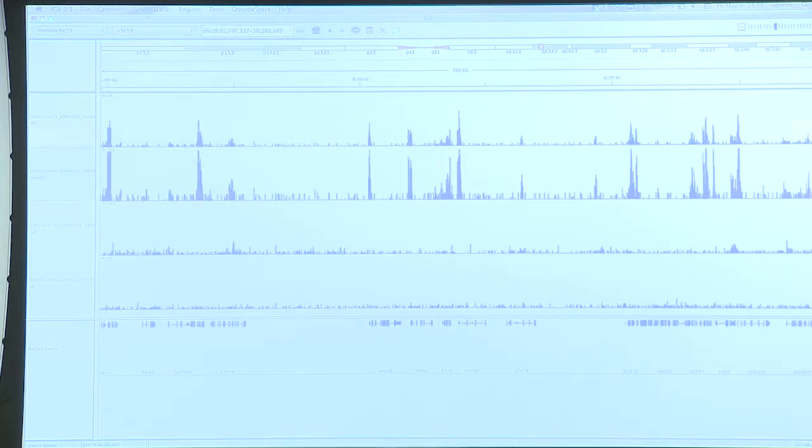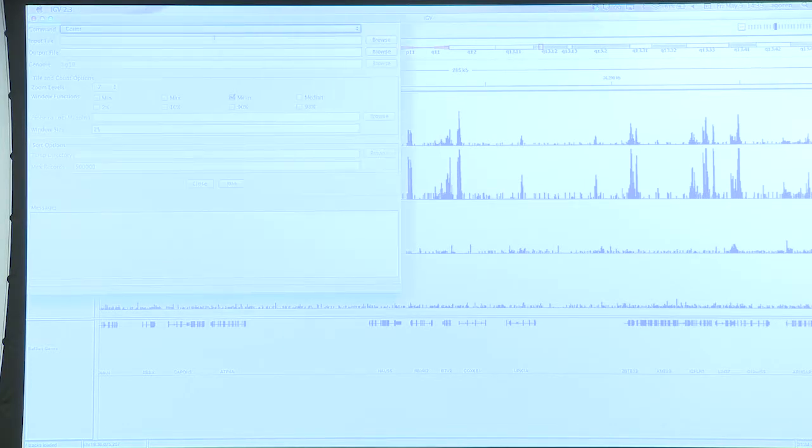And this is, again, what I was doing. I downloaded the BAM. I went into Tools. I did Run IGV Tools. And then in Run IGV Tools, from Browse, I went into the directory where I placed the files that we downloaded from GenePattern. I just double-clicked on the BAM file. And then I did Run.